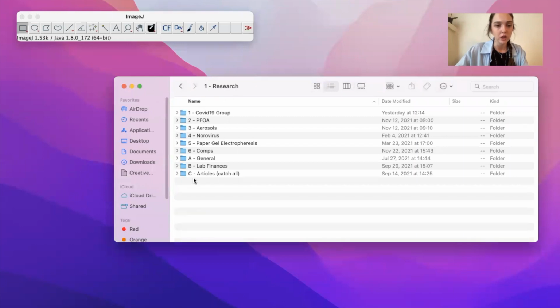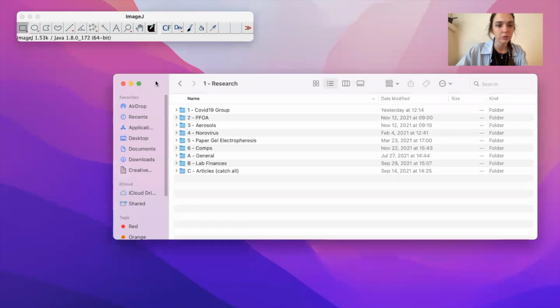Okie dokie. So, hold up. Let's go ahead. I just got to find some particle photos. Oh, that's on a microscope. Okay, so what I'm looking for right now is just some cute little particle photos. Ooh, look at how cute these are.